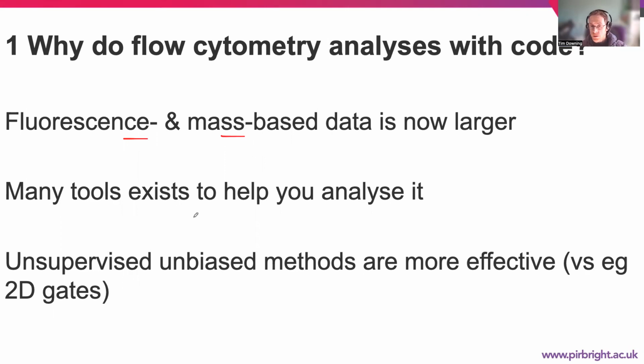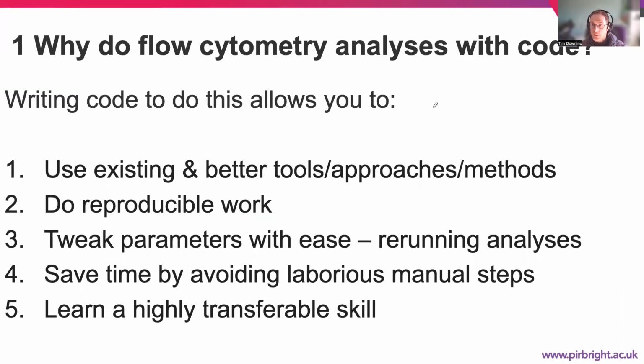There's lots and lots of tools and functions and packages and things that will help you analyze it. They've been written by people that are experts in that area, and allow you to use unsupervised methods that are non-manual and don't have any prior preconceptions of what to expect, and they're typically more effective than, say, two-dimensional gating. By writing code to do these analyses, whether it's very, very simple or very, very complex, you can use better tools and approaches and methods, more up-to-date methods.